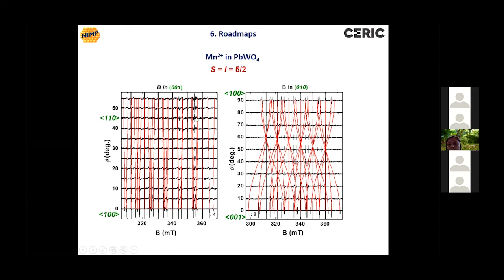If it would have had only the D parameters as I had defined them in the course, these lines shouldn't have varied at all. But there are also higher order terms which affect the spectrum. But anyway, this is the so-called isotropic part in the perpendicular plane. In the parallel plane, we see something very different from the not parallel plane. Let's say it is a variation from the parallel direction to the perpendicular direction.